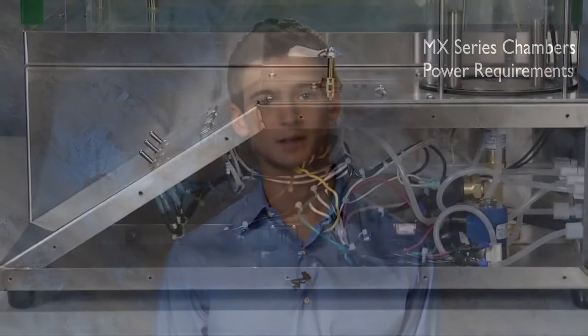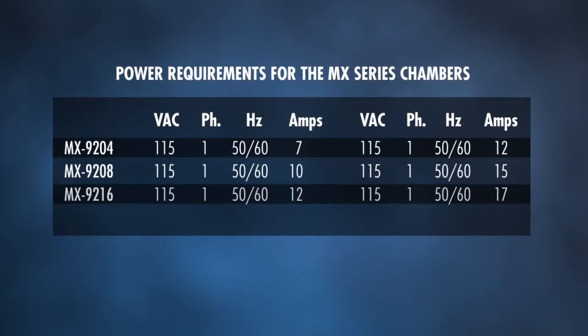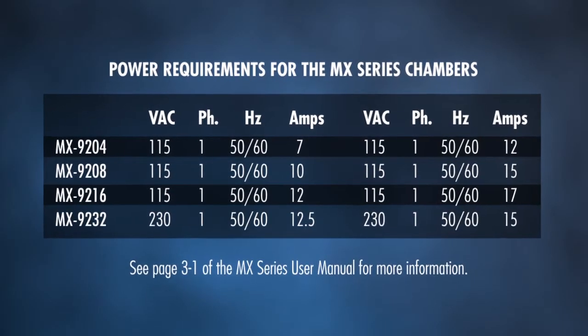The chamber and the electric panels are completely wired for use. The power source must be properly grounded. The standard power requirements are listed on pages 3-1 of your MX series user manual.